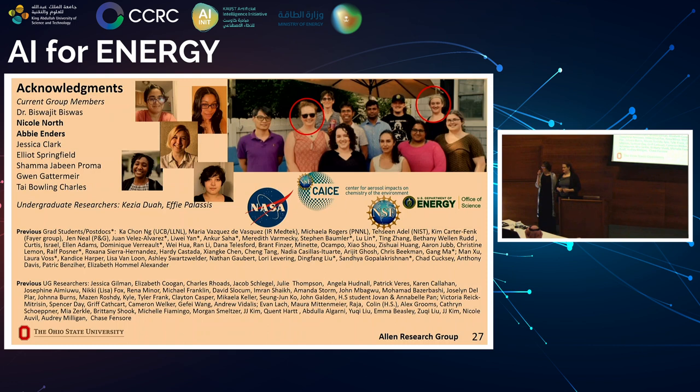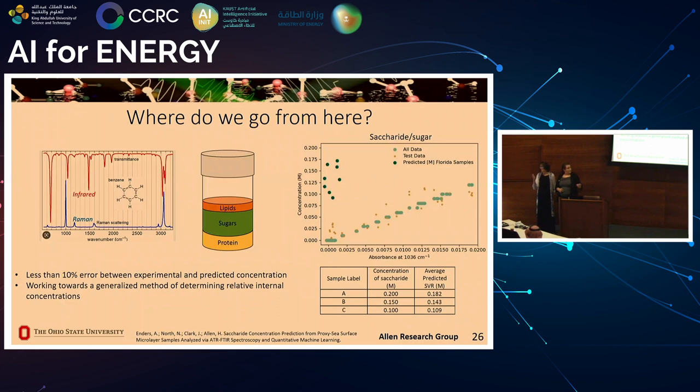Well, first of all, you can collect the sea surface microlayer. In fact, we've done this just recently. We went to Florida, and through dipping of hydrophobic and hydrophilic plates, you can actually peel off the sea surface microlayers. When that's done, the sensing techniques can be done on those solutions. So they can be applied both to sea surface as well as... Our Florida data is actually in this graph. I didn't have a chance to go into it in full detail. But these samples over here were surface samples, like Dr. Allen was saying, that we had collected. And then we used this model to determine the concentrations. And these match up relatively well with literature values of the expected amount of sugar in those samples. So future work is to couple those same samples to high-level lab-based mass spectrometry to get the actual ratios, rather than just comparing to literature right now. So we're collaborating with a group to do that, too.